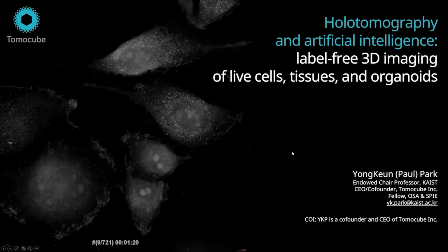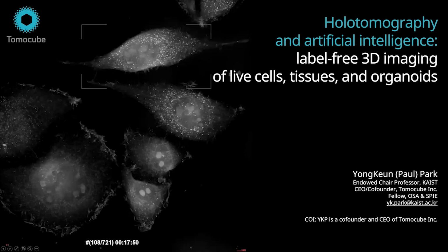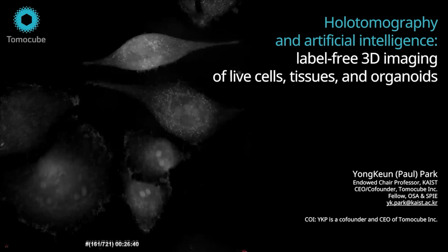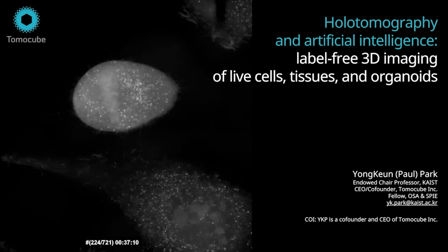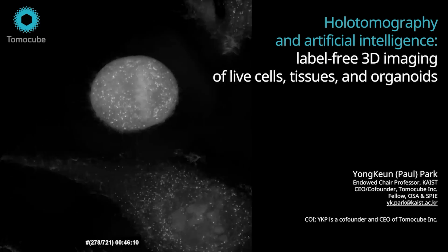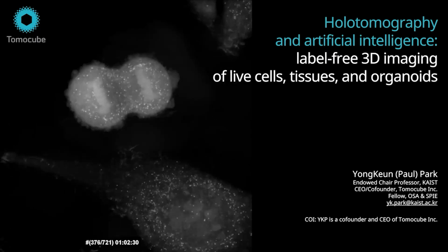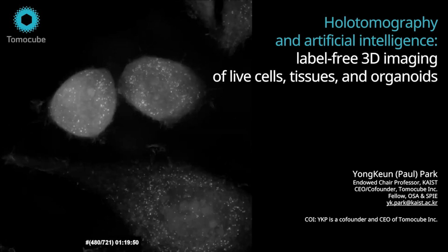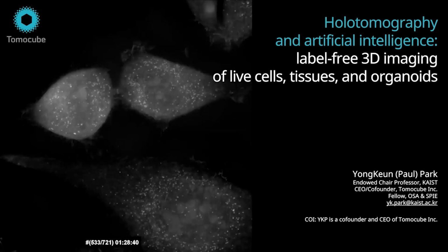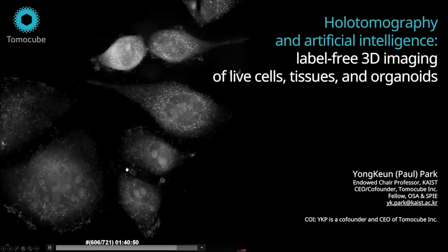So you can see the live cell without the use of fluorescent proteins or staining dyes, and you can see all the major subcellular organelles, such as you can see here. You can see the chromosome condensation, alignment, and separation of the cancer cell line, and those sparkling little spheres are lipid droplets. You can also see the nuclear membrane and the heterogeneity in the nucleoplasm.